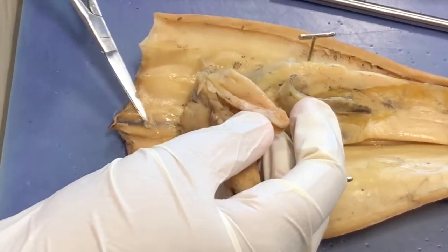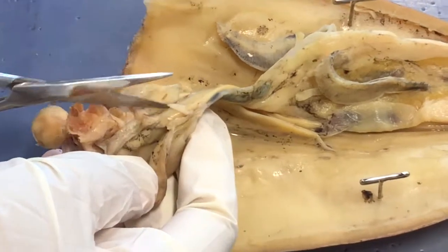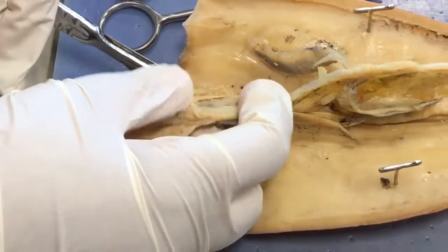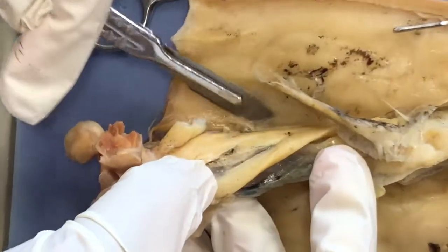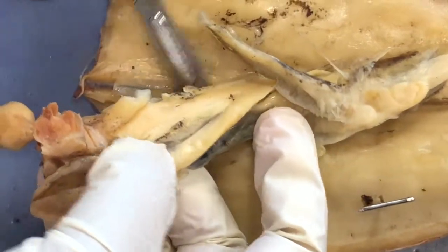Here I'm trying to find the esophagus. Basically, the brain wraps around the esophagus, and the brain is basically a donut around the esophagus. So it was really hard to find, so we were cutting a lot of membrane and body fat to try to find it.